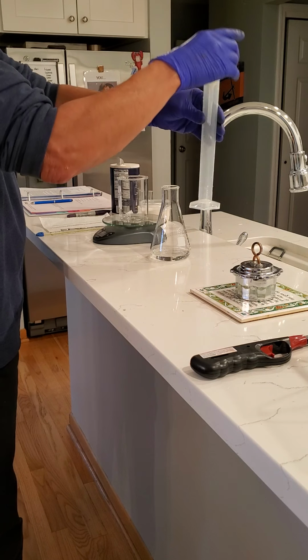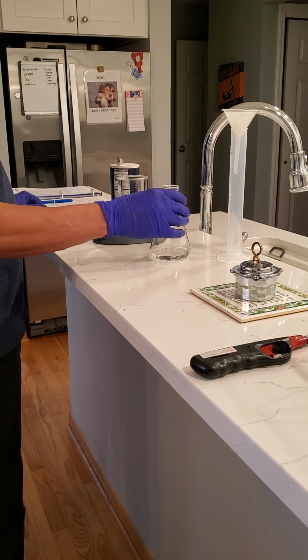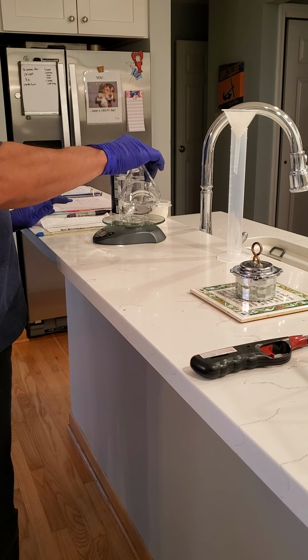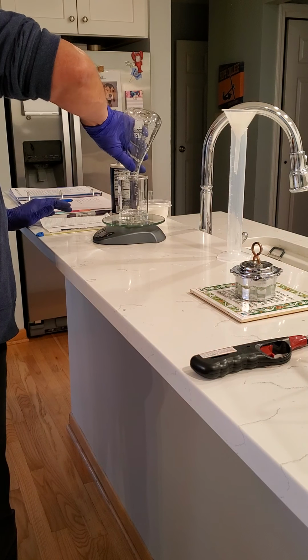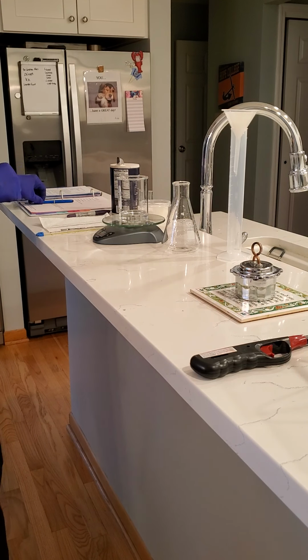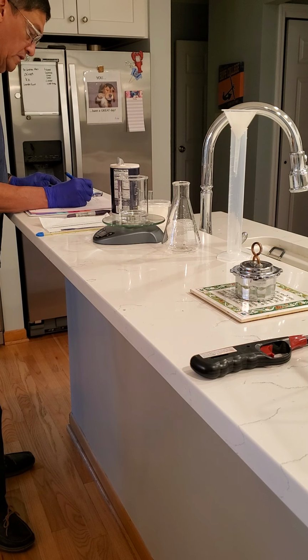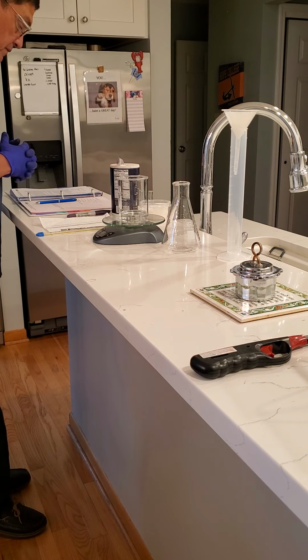So let's just call that good. We've got 4.1 for the beaker. Now we're going to add this to the beaker and record the total weight of the beaker plus the solution. And we have a total weight of 5.6 grams. So that means that the weight of the solution is 1.5 grams.